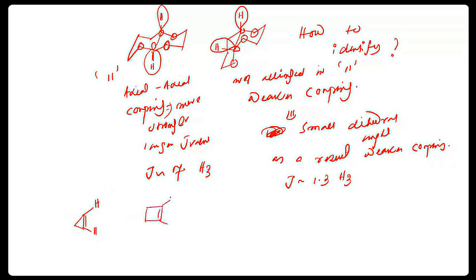Look, here they don't have any change in dihedral angle because they are projected on the same page of the book. It's a 5-membered ring, then comes the 6-membered, and so on. And you can have 7-membered also. Then how to detect them by NMR?